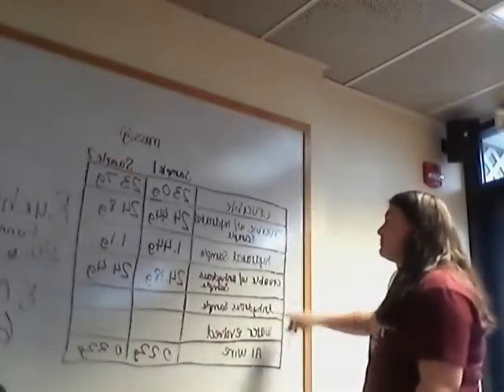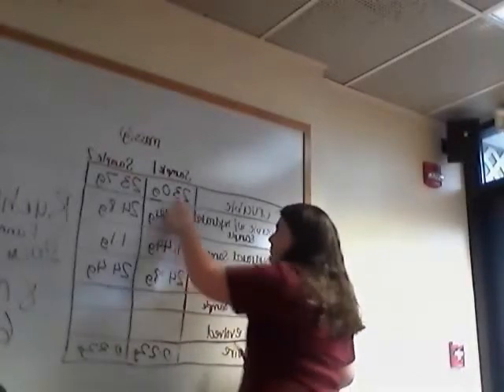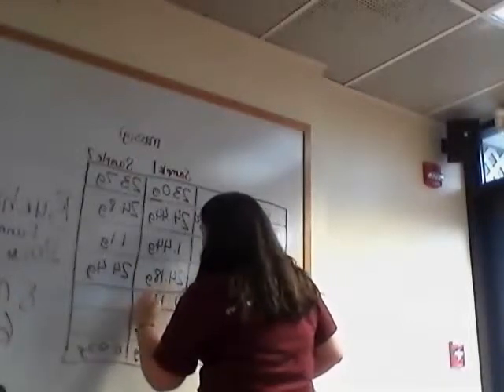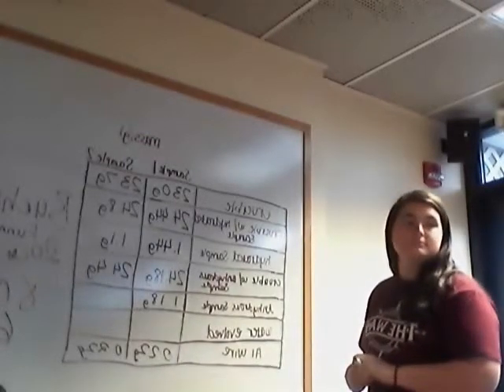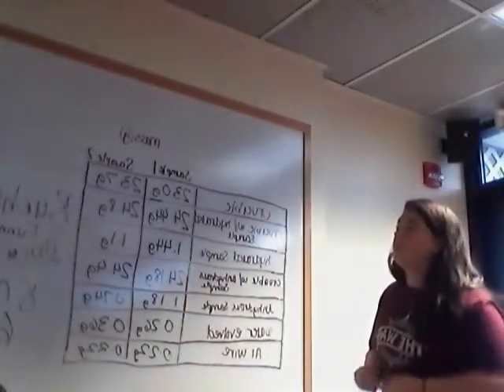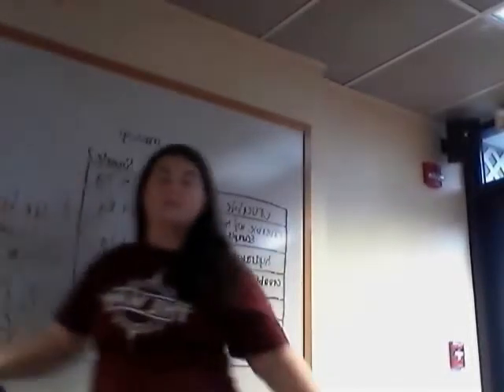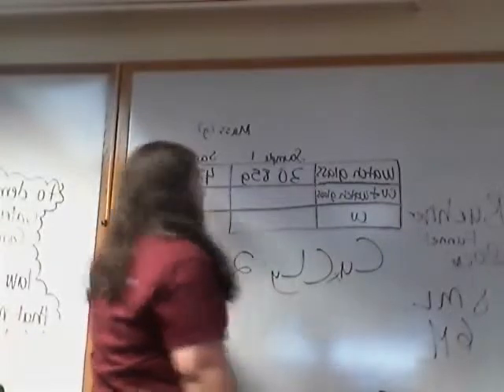To get your anhydrous sample, you take the crucible with the anhydrous sample minus the crucible by itself, and you get 1.18 grams. For the mass of this anhydrous sample, you get 0.74 grams. Now you have to measure the mass of the filter paper. The mass of the filter paper is 4.8 grams.